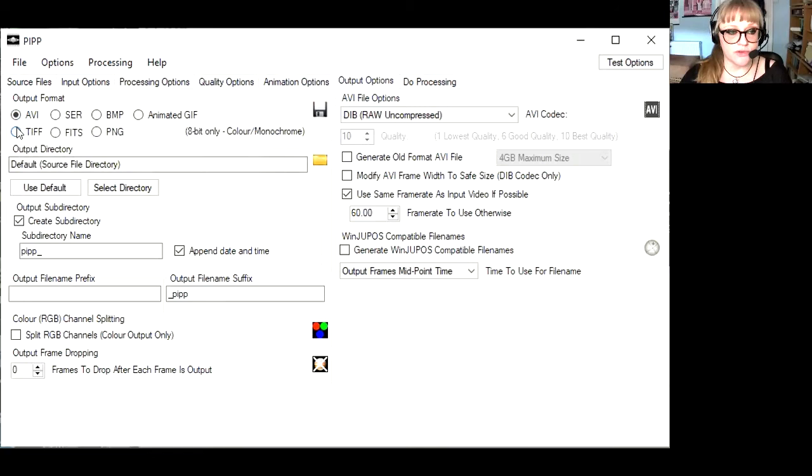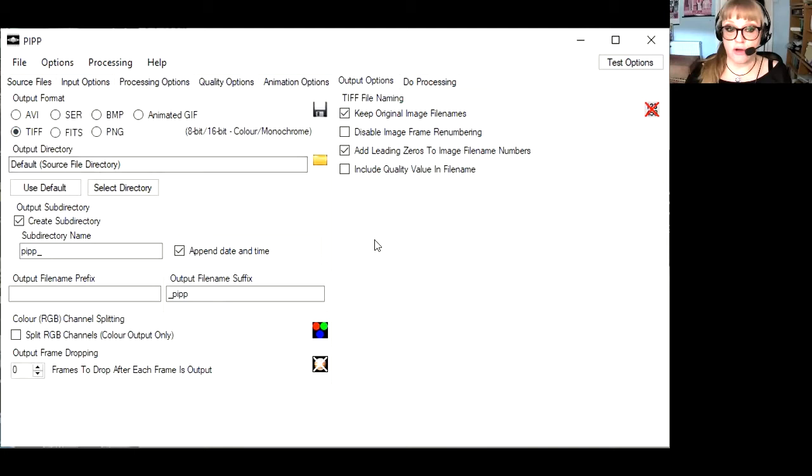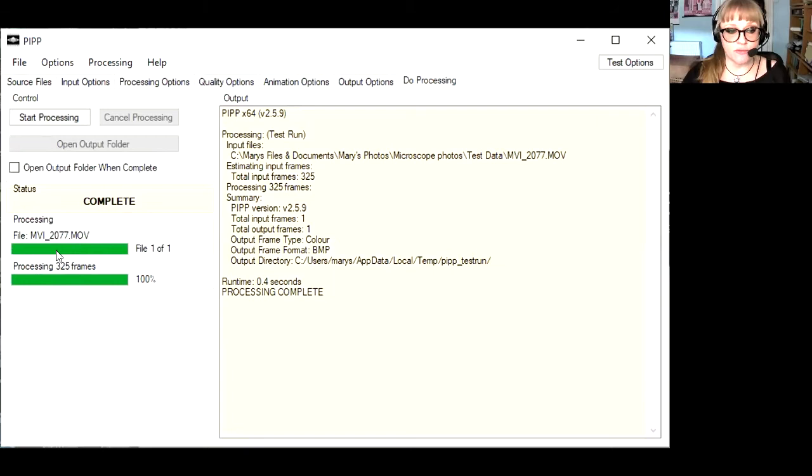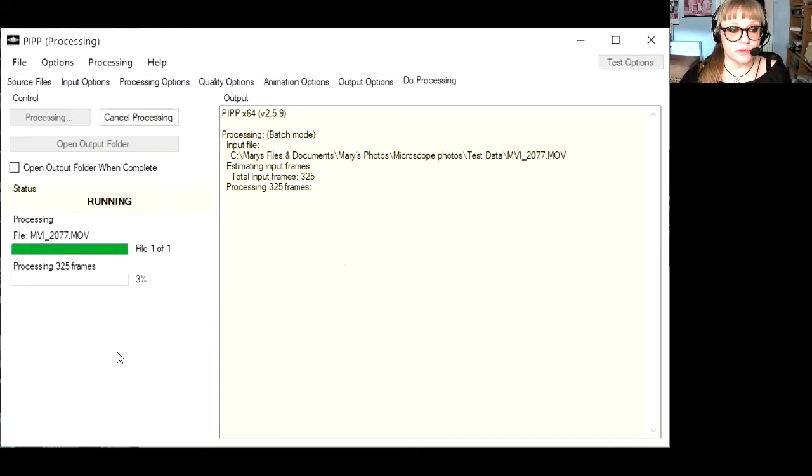Then you go to do processing. You can see that it's going to give me 325 images, so that's considerably more images than if you are just manually moving the focus each time. Even when I thought I was getting all of the range, I was probably only getting between 8 and 12 images, something like that. So 325 is quite a lot of pictures. Then you just click start processing and it will start extracting them and save them in a folder above the level that you got the data from.